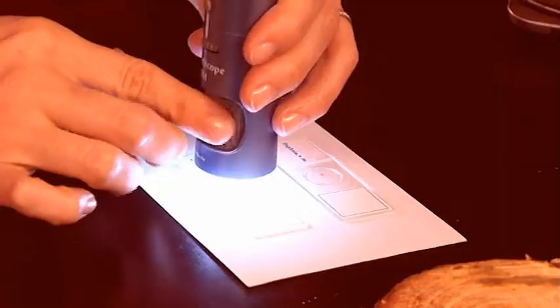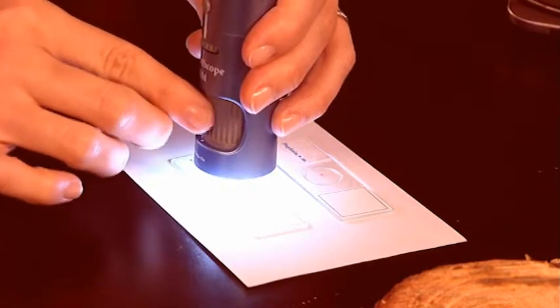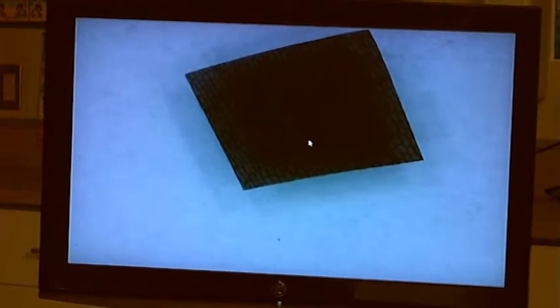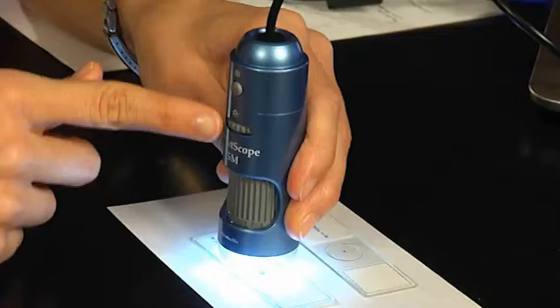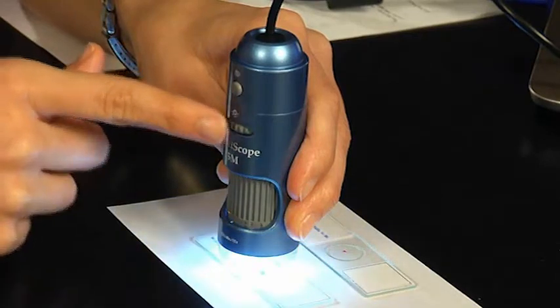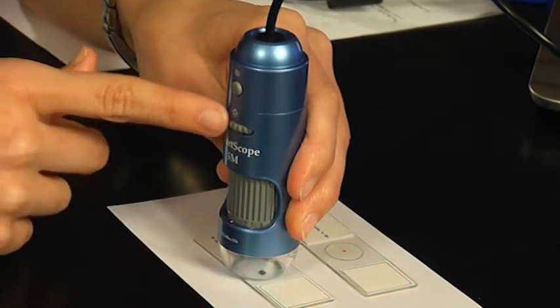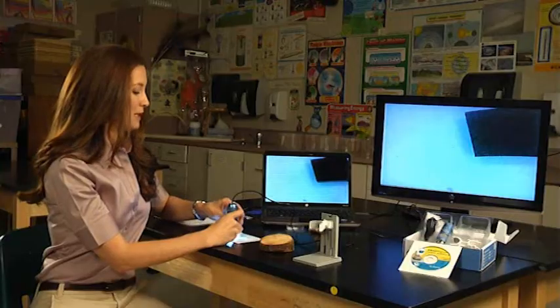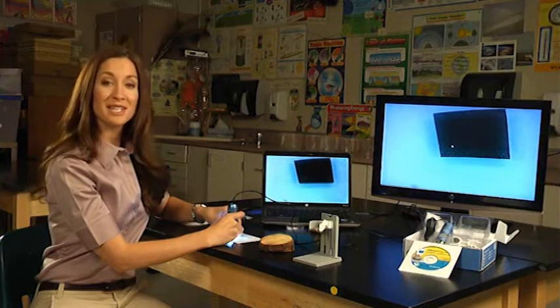Then you'll place it on the slide and then slowly turn the dial to the left. You'll see the image come into focus. This is at 100X magnification. It looks a little dark so I'm going to turn up the light on it. That's the middle dial. You can see you can adjust the light as well. So I'm going to turn it all the way up and get a lot of good light on that so we can really see it.